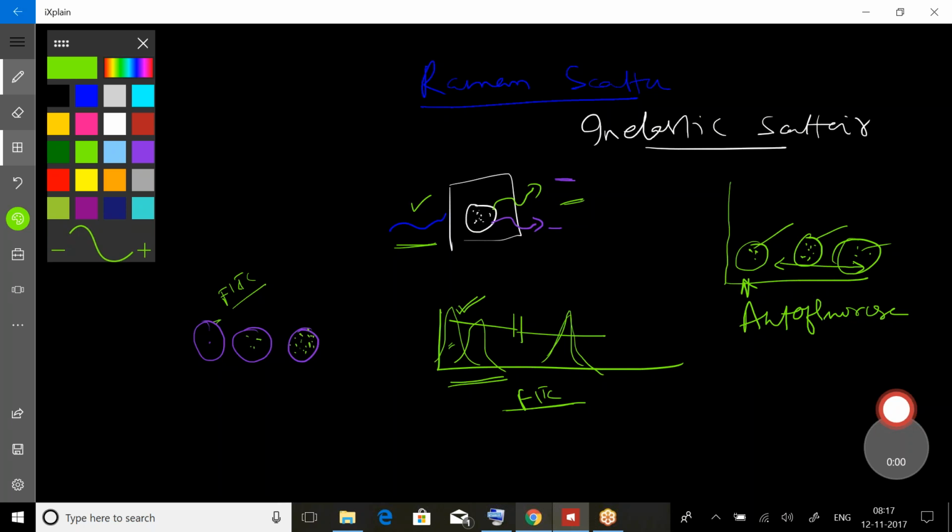Reagents are also coming to the market, because earlier there were not enough fluorochromes with distinct excitation and emission spectra, so it was not convenient to use those molecules simultaneously. But now new types of polymer dyes are coming, and because of that we can use multiple dyes simultaneously and still discriminate them on the basis of their fluorescence property.